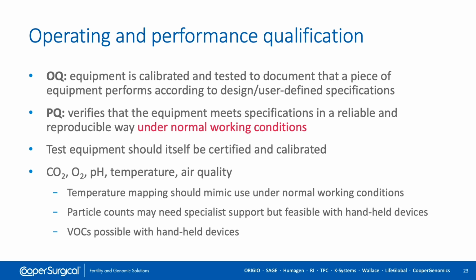Temperature mapping should reflect the way in which the equipment is used. Additional tests for particle counts and volatile organic compounds, for example, will require specialized testing devices or external support.